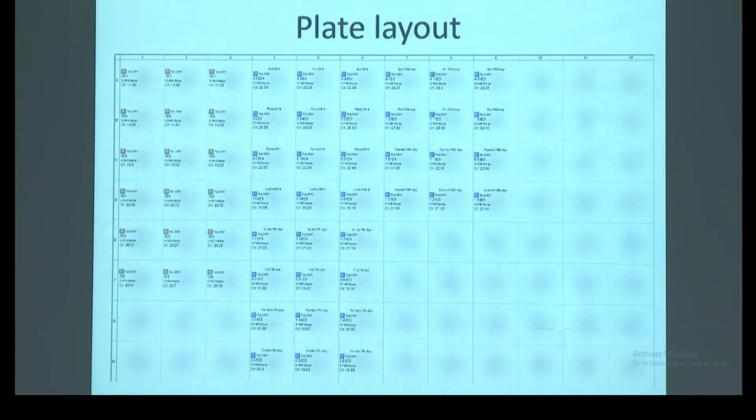So every time when you are going for quantification, every time आपको ये standard प्लेट में लोड करना पड़ेगा. ऐसा नहीं कि एक बार आपने ये standard calculate कर लिया, आपने ये unknown sample run किए, जो CT value मिली Excel में आपने calculate कर दिया. थोड़ा vary करेगा, result always vary करेगा. To get it very clean, do it every time.